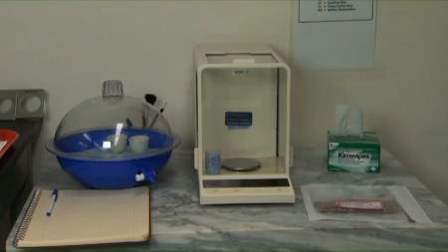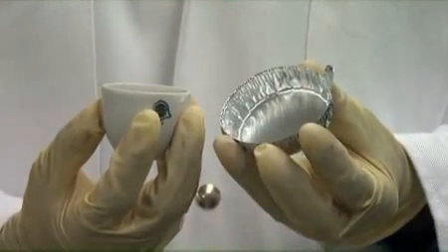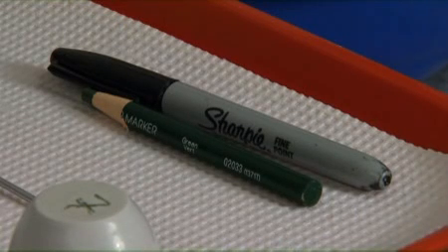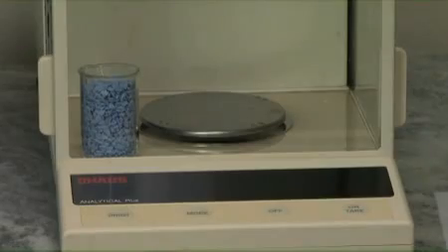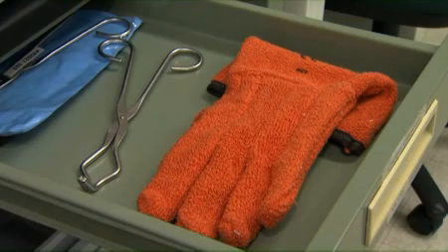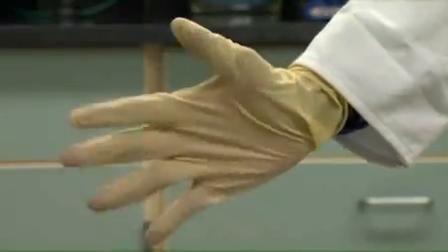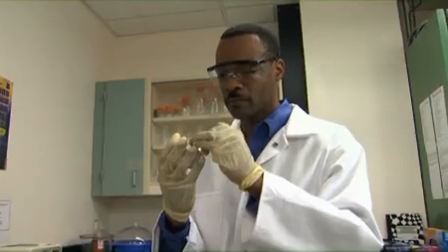The necessary supplies for Percent Moisture are: ceramic crucibles or aluminum pans, a wax pencil or permanent marker, a Fisher Isotemp drying oven or equivalent, weighing spatulas, an analytical balance, a desiccator with dry write, heat-resistant gloves, oven tongs, latex gloves, safety glasses, a timer, and a lab coat.